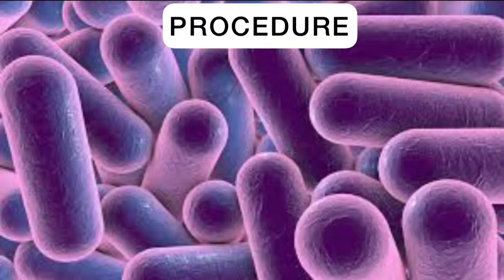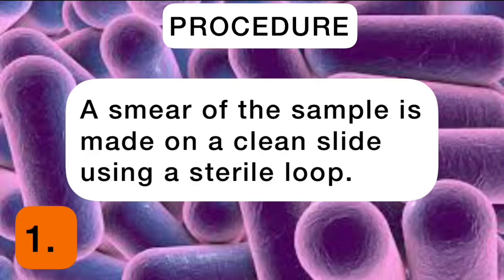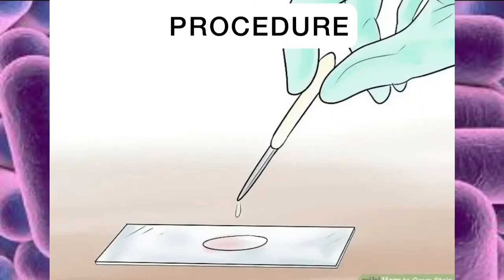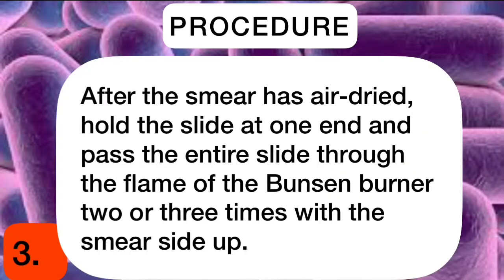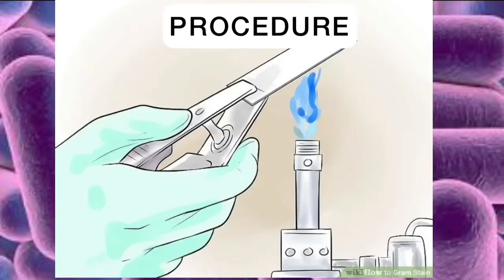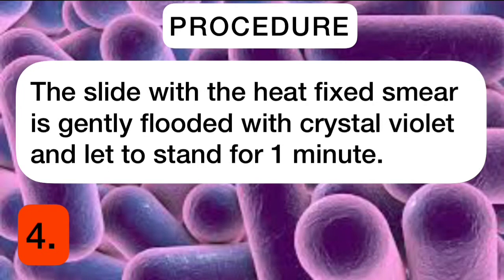The procedure for carrying out the gram stain technique is as follows. A smear of the sample is made on a clean slide using a sterile loop. The smear is then allowed to air dry. After the smear has air dried, hold the slide at one end and pass the entire slide through the flame of a Bunsen burner two or three times with the smear side up. The slide with the heat-fixed smear is then gently flooded with crystal violet and let to stand for one minute.